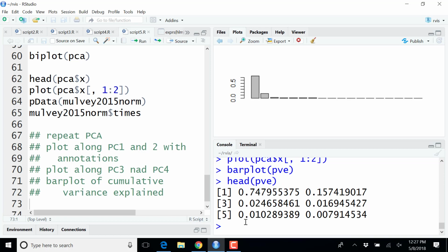We are going to see that later after lunch, because this is not something you can get. And we'll see this in detail. What you're asking for is, what are the proteins that explain this variability? No, you're not allowed to do that. You will do a t-test for that. You will do a hypothesis testing analysis to tell you which are the proteins that explain the difference between two groups. We'll see this later. In other words, there is no correlation between your p-values and these things that are calculated by the principal component analysis. We'll see that later.